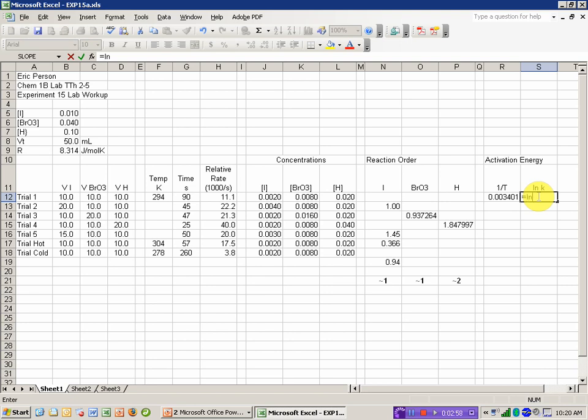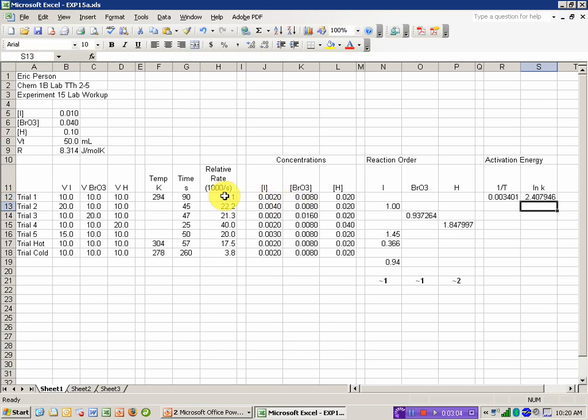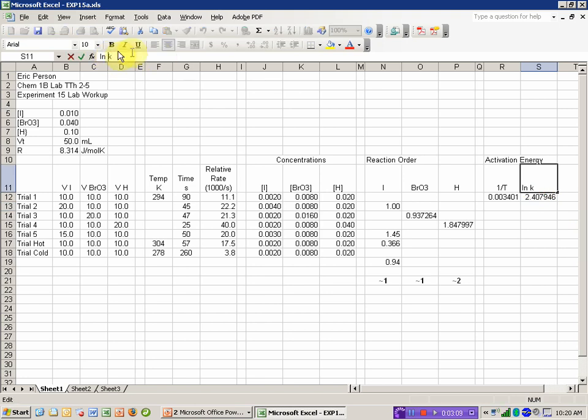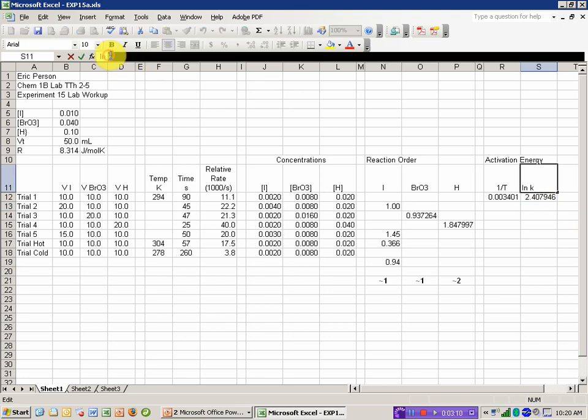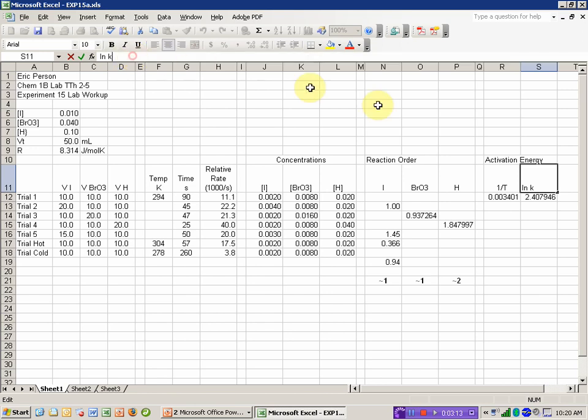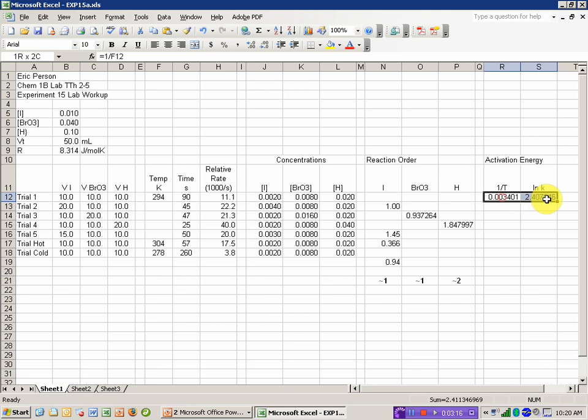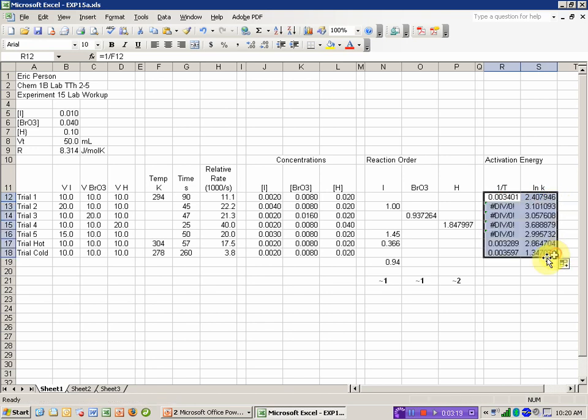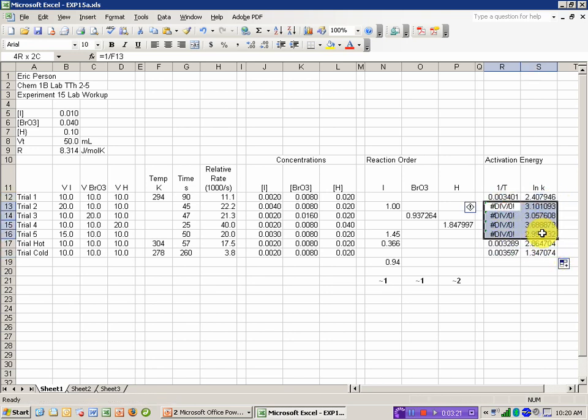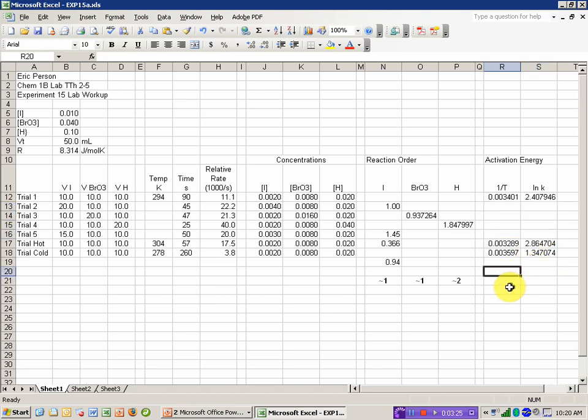So our 1 over temperature, I can just do equals 1 divided by, and I already had the temperature entered in Kelvins. If I didn't have it entered in Kelvins, I'd need to do a conversion here. And the natural log of the rate is equal to, and the function for natural log is just ln. I'm going to drag these down. But I had a number of cells where I wasn't using that temperature information. I'm just going to delete them so they're empty.